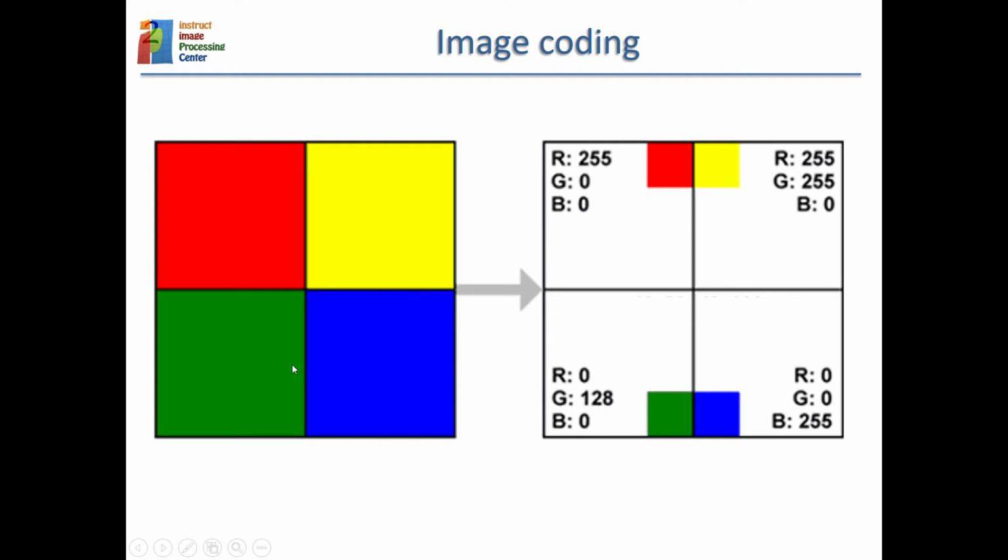Then it is green, but it is not the brightest green that you can have. And if you combine colors in different channels, then what you have is a combination of those colors. For instance, if you combine red and green at the same intensity, then what you have is a yellow. And if you put both to the maximum intensity, then you have the maximum yellow you can have in the computer.